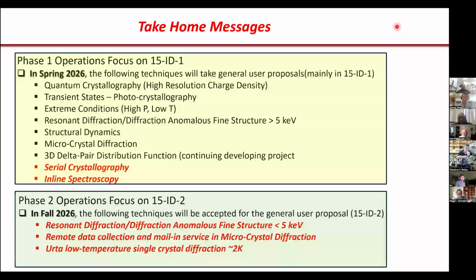Okay, but another best beamline would be the sector one, and go to probably 25 kV. We can discuss. If we really cannot enlarge the beam and serial crystallography doesn't work, then we can have other things to do. Okay, great. Thanks.